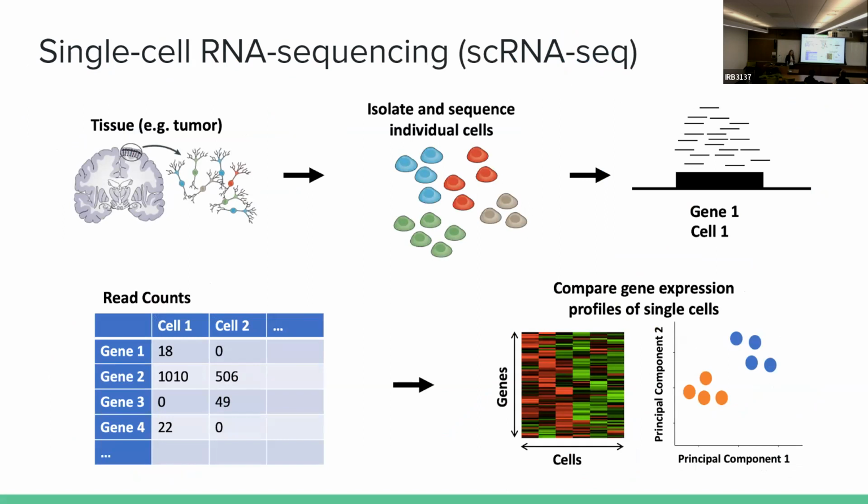And for simplicity, I'm going to take the liberty of fast forwarding it. So at the end of the sequencing experiment, you get a readout of what I'm going to call reads. And we just have to figure out where those reads map to, let's say, for example, in some kind of reference transcriptome. If I did my math right, there are 18 barcodes, there are 18 reads there. And so that number 18 gets recorded in a matrix.